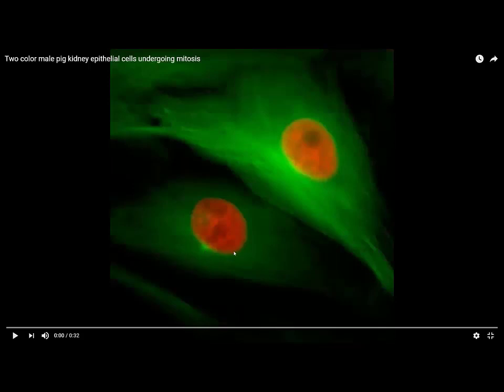So let's watch this a couple times, and I want you to pay attention to what happens with the DNA, because we're going to see something very interesting.